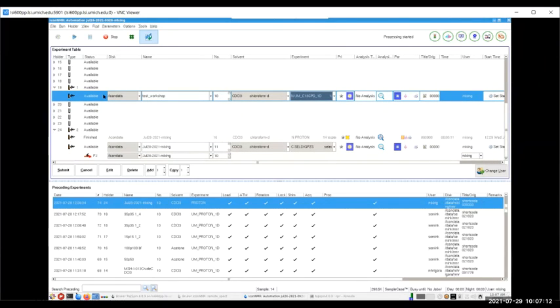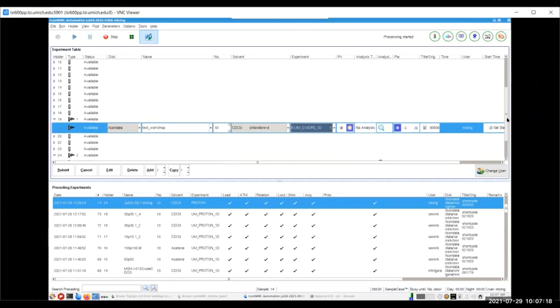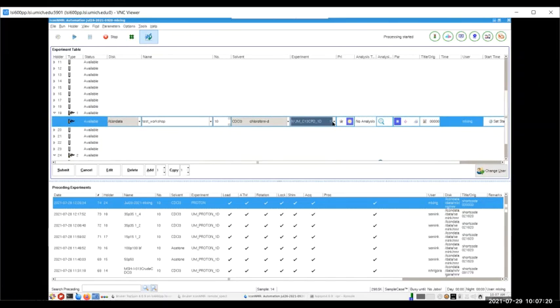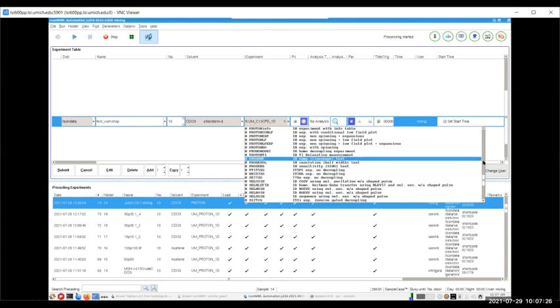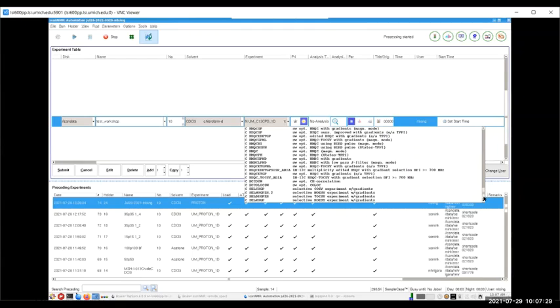If we want to run selective 1D NMR experiments, like the selective 1D TOCSY I mentioned today, we can go here and select the one we want to run. The TOCSY experiment is at the very bottom. The one I want to select is this selective TOCSY experiment. You can also select other ones like selective COSY, NOESY, and ROESY.